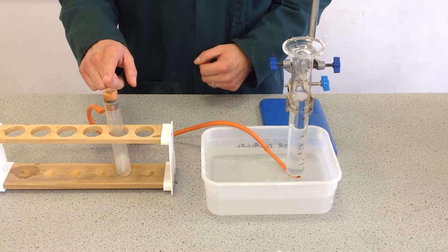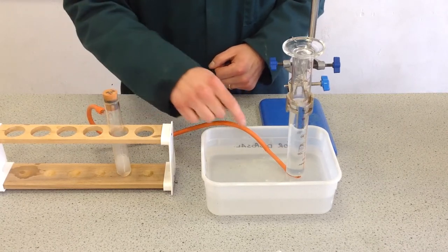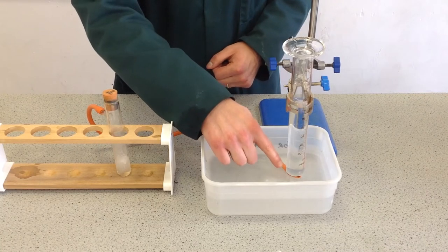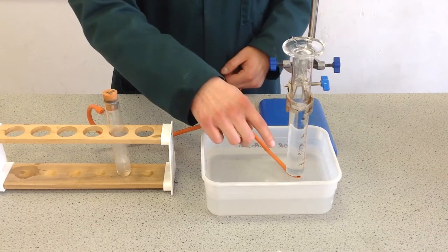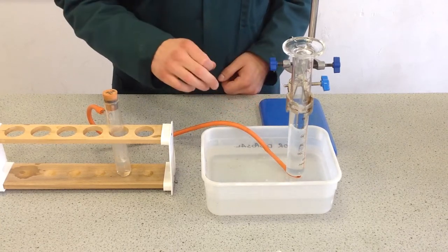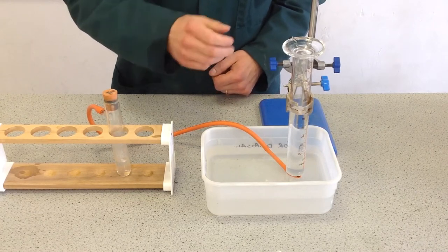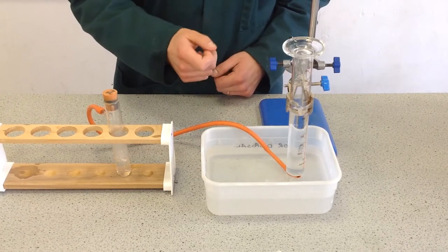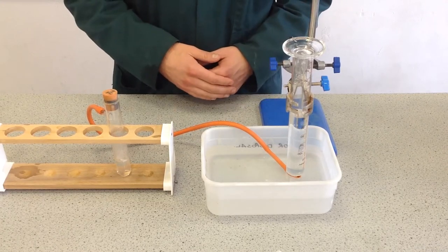What is gas collection over water? We've got a reaction vessel here with a bung in to prevent gas escaping from the top, so it's going through the delivery tube and into this inverted measuring cylinder. Because the gas produced is less dense than water, you can see it bubbling up to the top, and the gas is pushing the water down as it collects in the measuring cylinder. The gas is above the water — collection over water — and it's pushing the water out, so it's known as displacement of water.